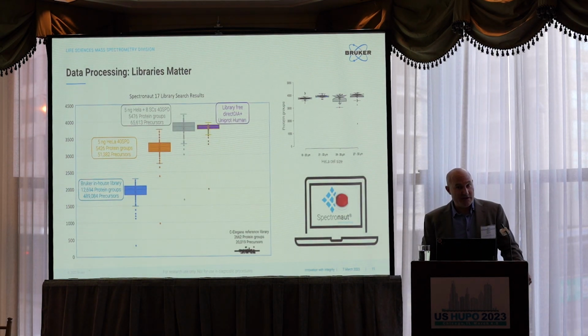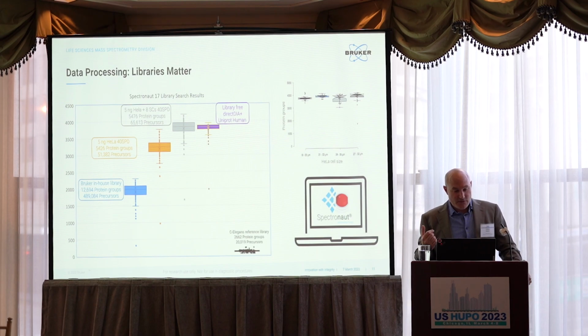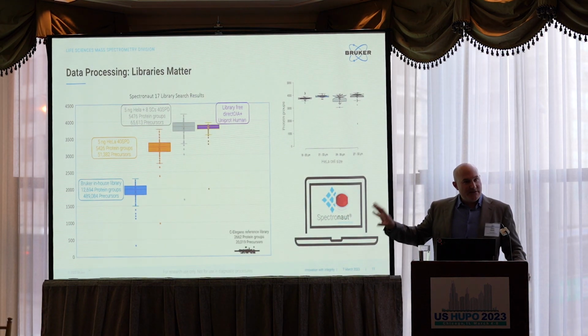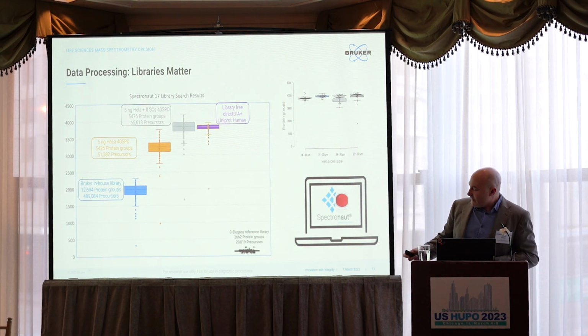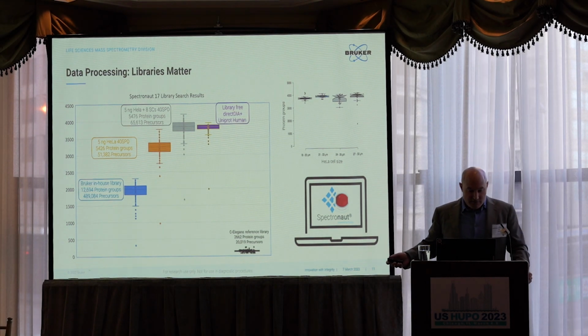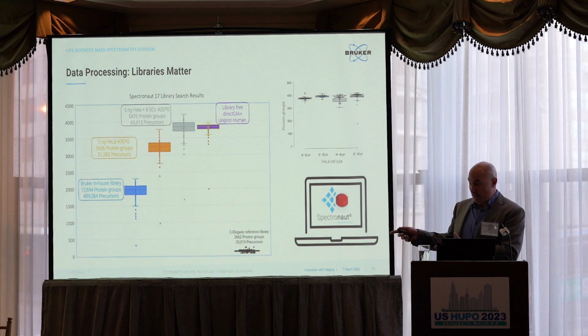Of course, all of this was searched by Spectronaut 17, and there's a lot of advantages using Spectronaut 17. One is the ability to use the libraries of your choice, and the fact that you can do project-specific libraries. This is really important to us, and this is what I'm showing you here. At Bruker, we built quite a big library over time, and this very large library that I'm showing you down here has almost 13,000 protein groups and almost 500,000 precursors. That's from highly fractionated, high pH reverse phase DDA runs generated from 2 cell lines, MOLT4 and K562, so different cell lines than the HeLa we're studying here.